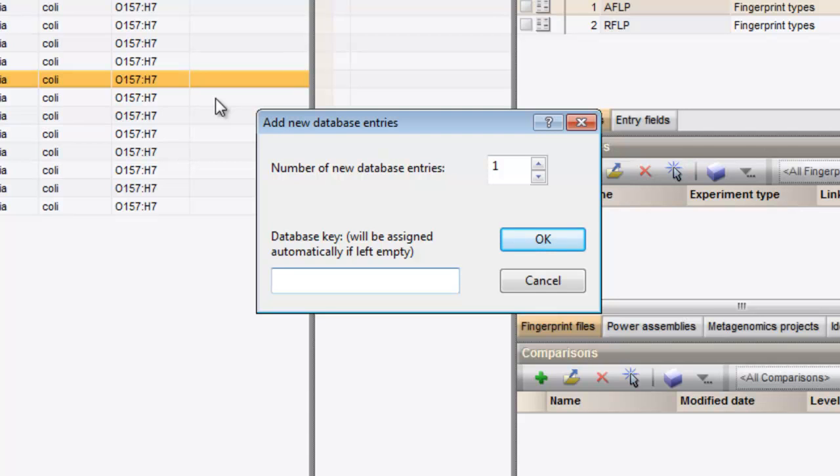The input field in the bottom of the window allows a key to be entered by the user. This input field is only accessible when one single entry is added. As soon as the number of entries is specified to be more than one, the field is disabled.